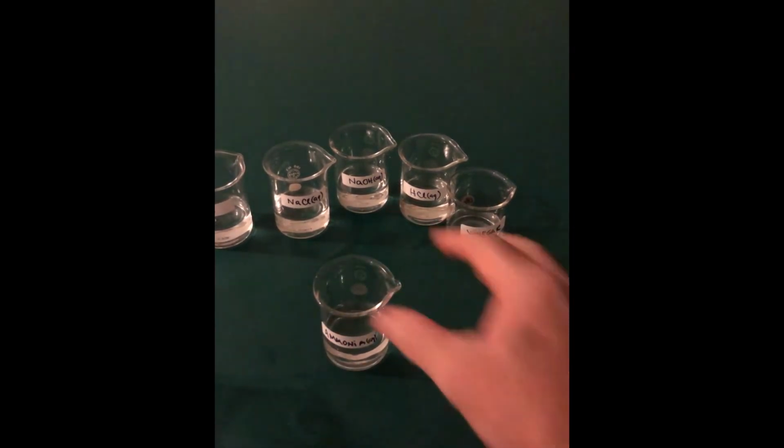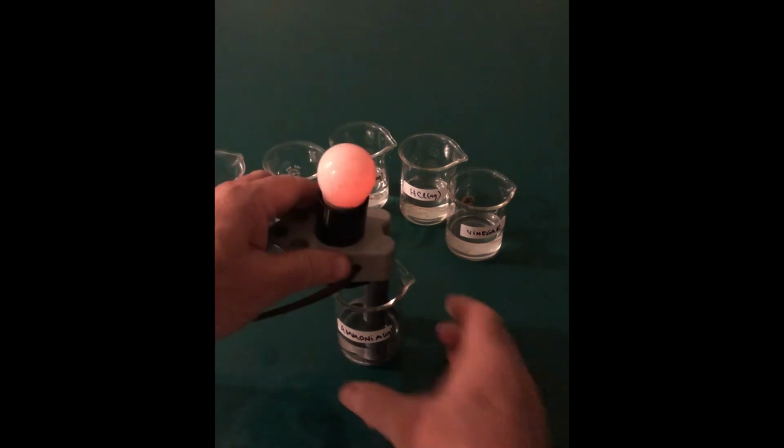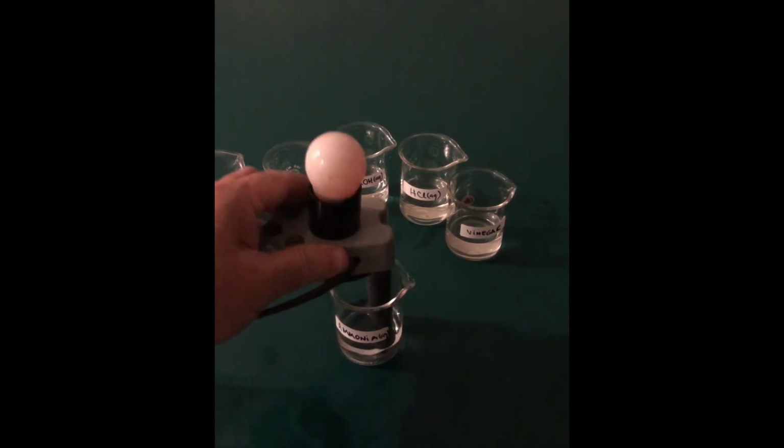Let's try another item. In the meantime, I'm going to be rinsing out our electrodes. All right. And let's try out what happens when we put it in ammonia. Now, this is an ammonia solution, of course, and actually in ammonia, we have another molecular compound. So let's test it out. And you can barely see that the light bulb is barely turning on, very, very dim.